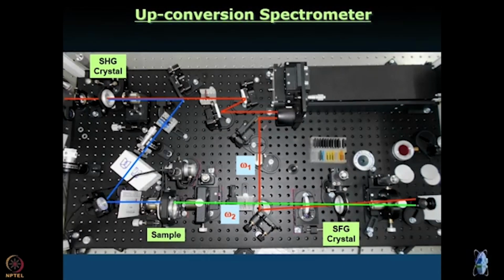Before going any further, let us make sure that we have not forgotten what kind of light that red light is. Is it continuous wave light or is it pulse light? It is pulse light, right, where remember it is the output of a femtosecond pulse titanium sapphire laser. The full width at half maximum of the pulse would be something like 100 femtoseconds in our case. It can be even smaller. Pulsed light. Omega 1 is pulsed. So, what does it look like if the x axis is time? It looks something like this.